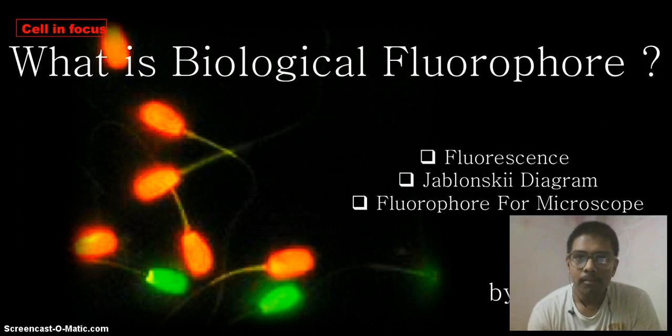In light microscopy, a colored image is going to be generated. Now, how is the colored image generated, meaning where is the color coming from? One answer is that we are using light from the visible range.